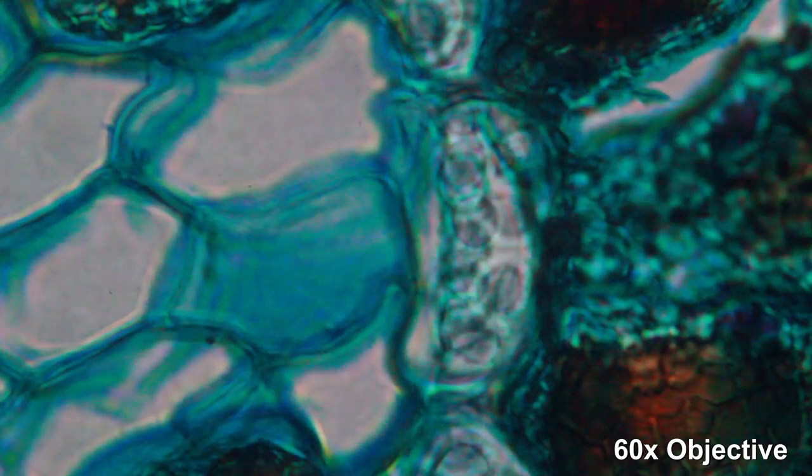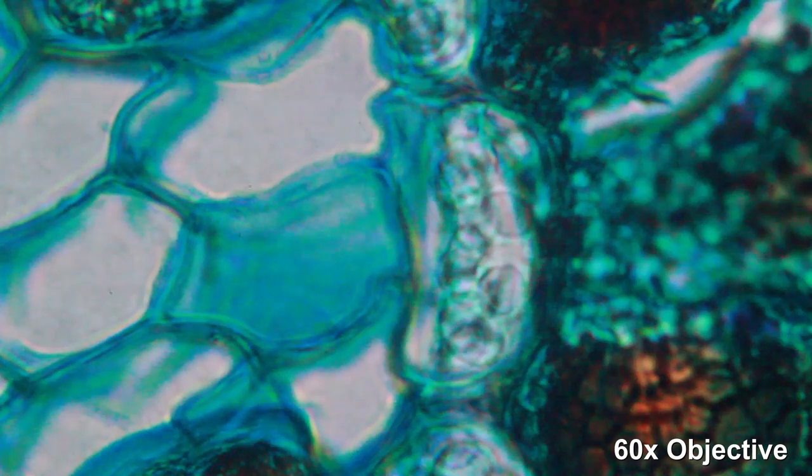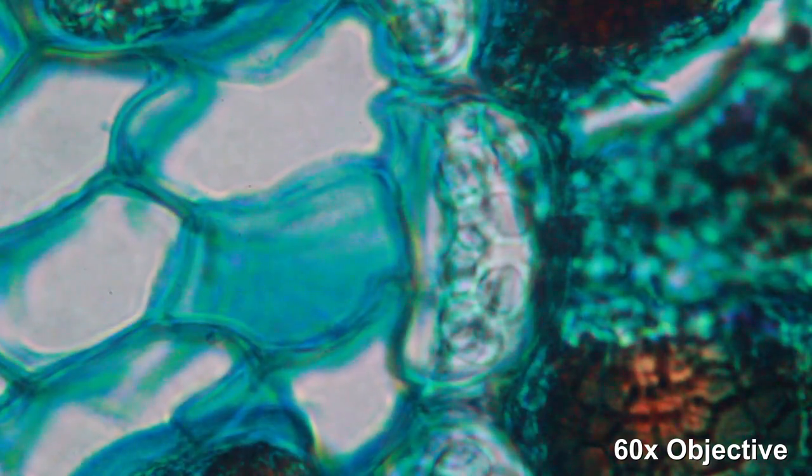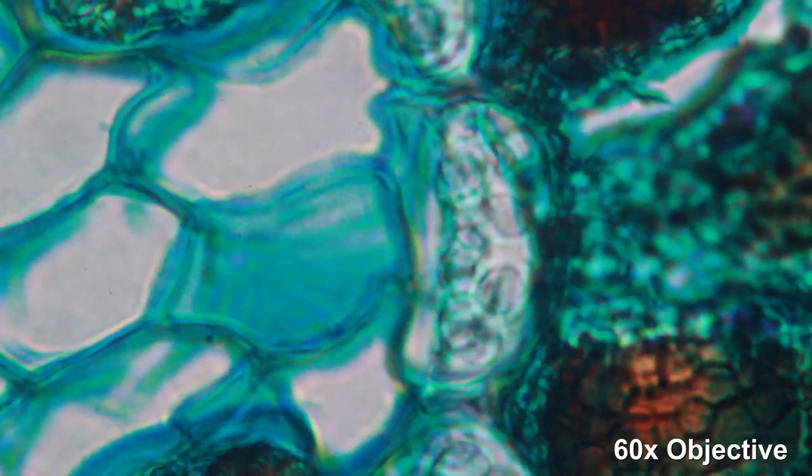Here, again, a large magnification of an endodermis cell. I think that these structures in there could be starch storage grains. I'm not quite sure about that, but I think that this could indeed be the case.